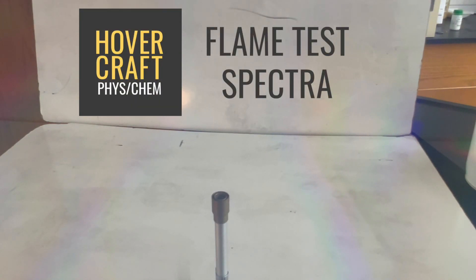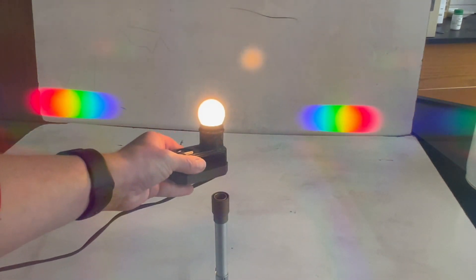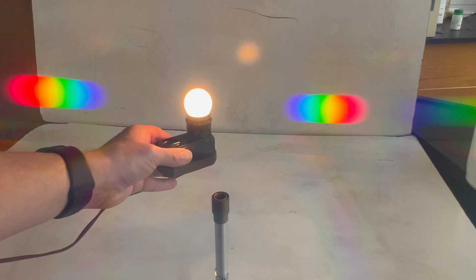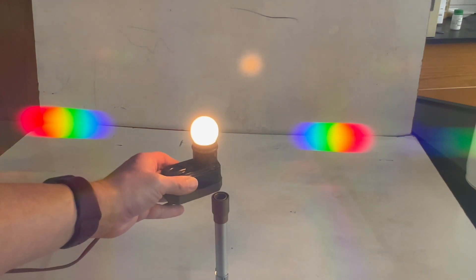In this video, we're going to look at flame tests of different metal ions. This is traditionally done just by looking at the color observed with the naked eye. I wanted to see if we could find any information about the actual spectrum of colors coming out from the different metal ions. So I put a diffraction grating in front of my camera, and so I will get that kind of prism effect that we can see here with white light. And if there are multiple different wavelengths produced by the flame test, I'm hoping we can see those as well.